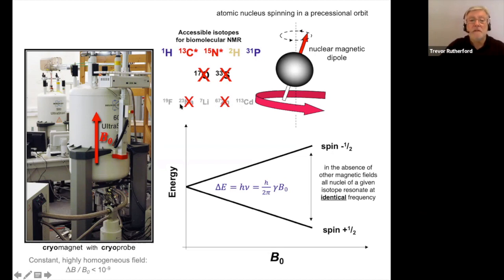We can look at lithium. We can look at fluorine in some cases. It's being used a lot in the pharmaceutical industry for screening projects. If you've got something like sodium that you wanted to see, you can use a surrogate such as rubidium, which is also a monovalent cation that you can use as a surrogate for sodium, but is more NMR friendly in our case.